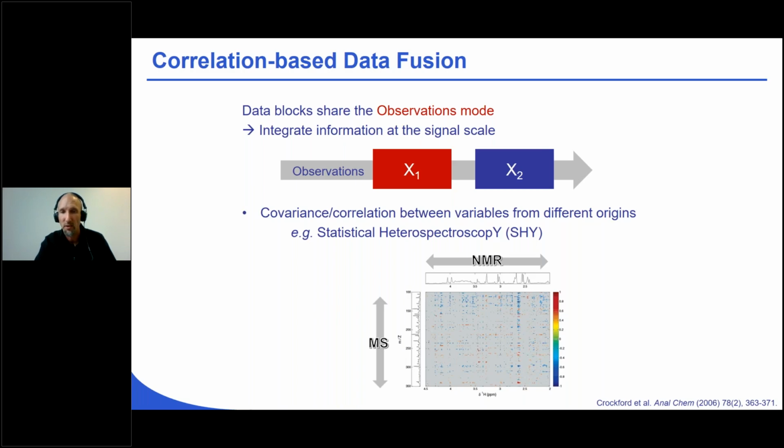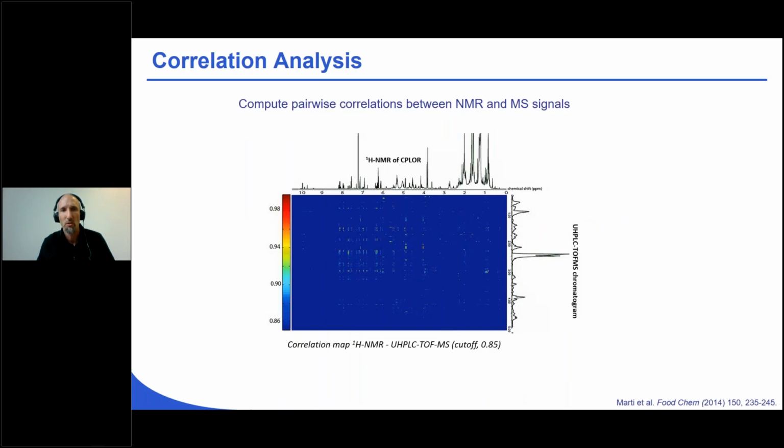And you generate this kind of map, which can help to highlight which peaks detected in mass spectrometry are related to different peaks in NMR. This helped us get first information about some of the compounds we found interesting. For example, here we found that one compound with a given retention time and m/z ratio value could be related to a series of chemical shifts we measured with NMR.